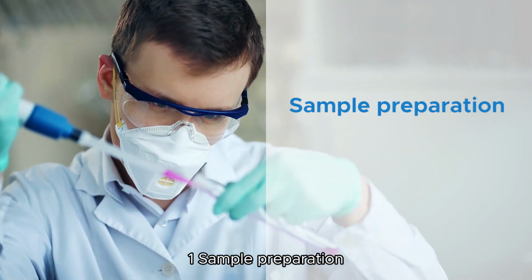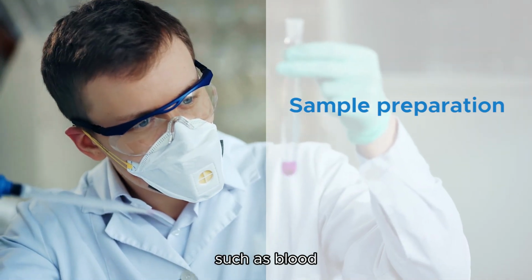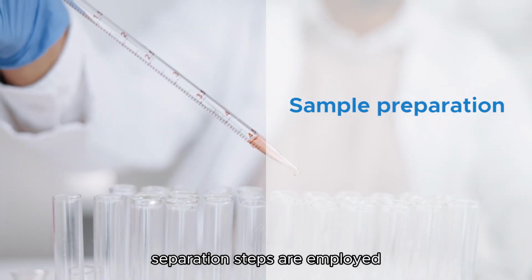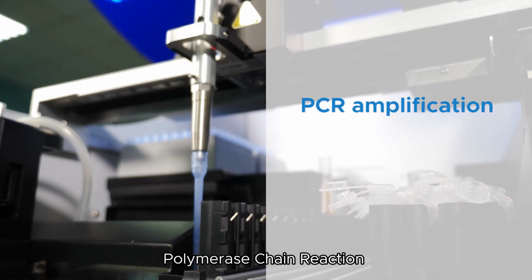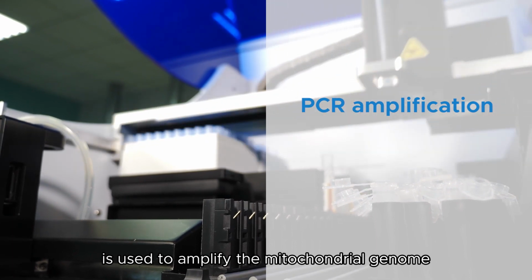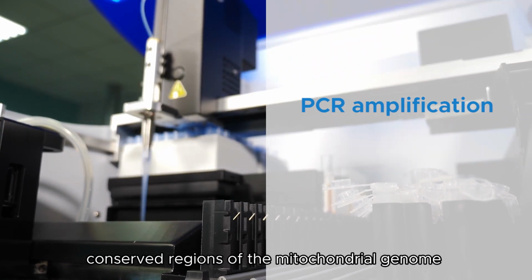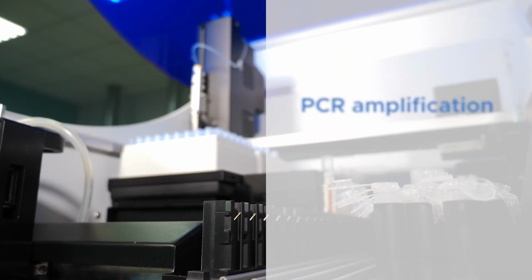1. Sample preparation. Samples are derived from various bodily fluids, tissues, and cells, such as blood, oral swabs, skin tissues, etc. Typically, chemical dissolution and organic solvent separation steps are employed. 2. PCR amplification. Polymerase chain reaction, PCR, is used to amplify the mitochondrial genome, increasing the quantity of DNA sequences in specific regions. Typically, conserved regions of the mitochondrial genome are selected as target sequences for amplification.